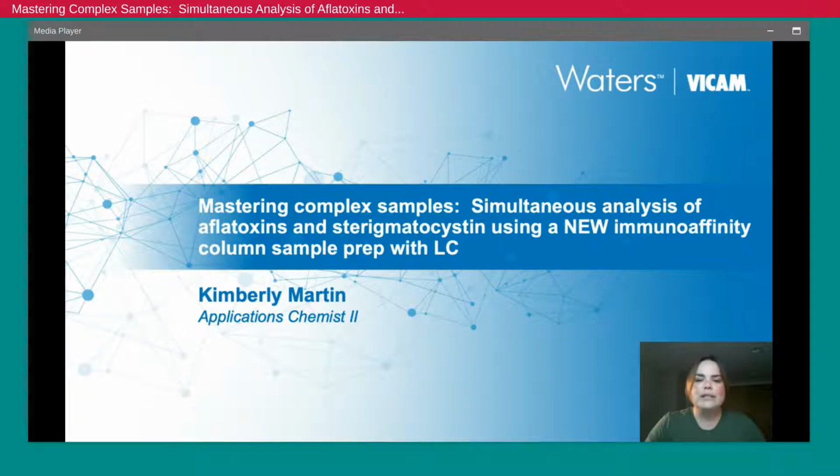Today I will be discussing mastering complex samples using immunoaffinity column sample prep with HPLC and UPLC.